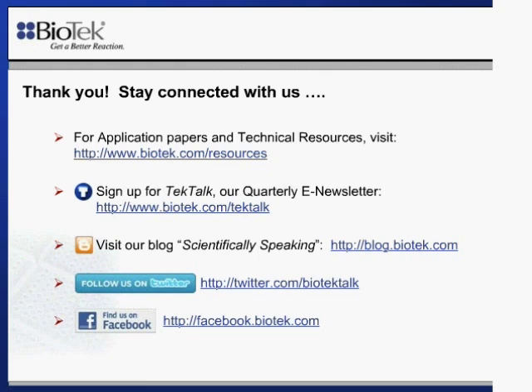Let's see. So we have a question. The NanoDrop measures the 230 nanometer reading also to determine purity of RNA. Does the Take3 plate have the same features?